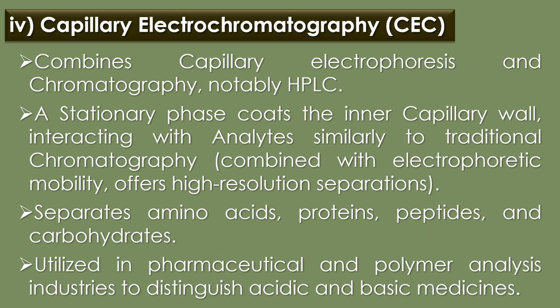The fourth type of capillary electrophoresis is capillary electrochromatography. Capillary electrochromatography combines capillary electrophoresis and chromatography, notably HPLC. A stationary phase coats the inner capillary wall, interacting with analytes similarly to traditional chromatography. This interaction combines with electrophoretic mobility and offers high resolution separations.